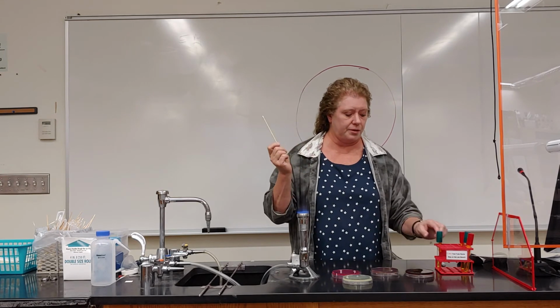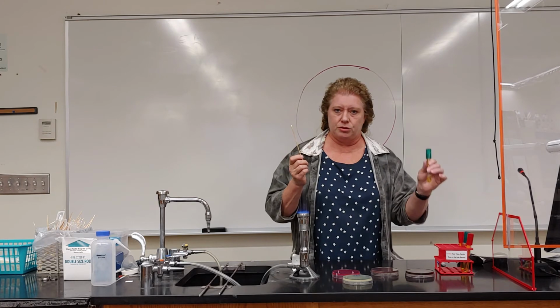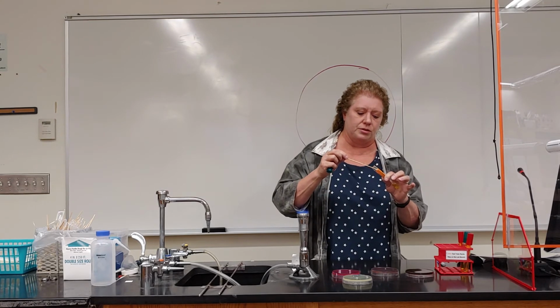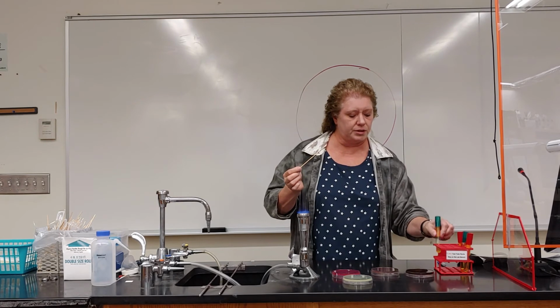Remember, don't put this in the flame. Don't put it down either, because then it will be contaminated. Pick up your tube again. Remove the lid. Clean the top. Go in. Soak your swab. Flame the top. Put it down.